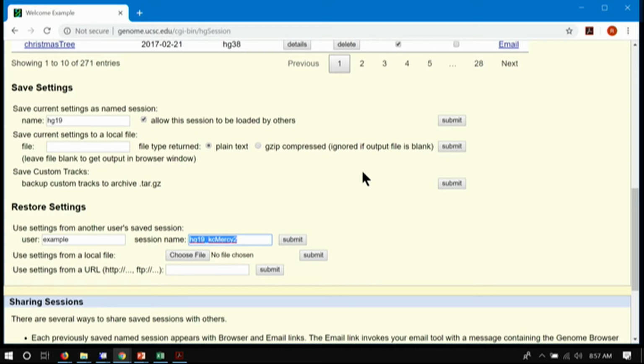So it's worth, yes? Is there like an undo button on this, where if you do something and you just want to go back to what you were doing immediately before, you can hit undo? I think the back button should help you do that. In general, we don't encourage the use of the back button, but the settings thing is an undo button itself if you want, because you can save something, then you can go away and you can come back to where you were, use it as a bookmark. Yes?